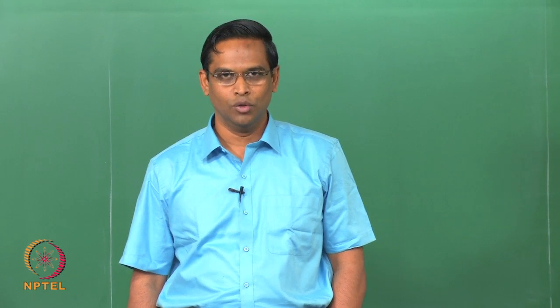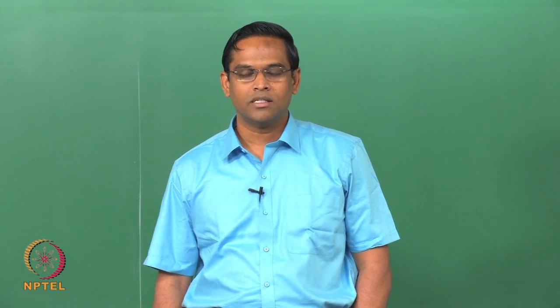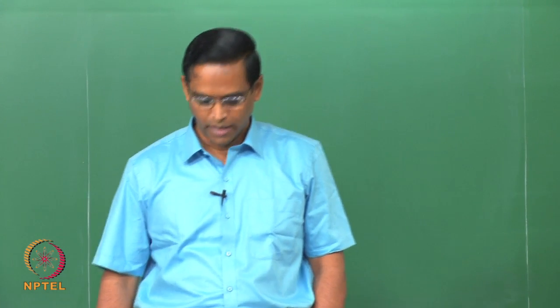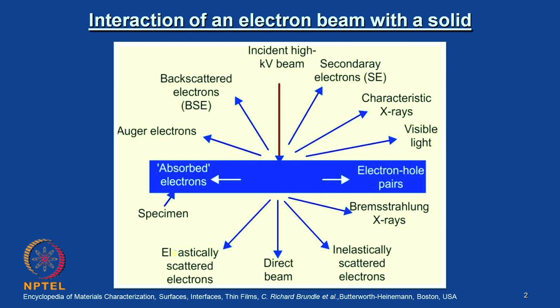So, before I start these lectures on fundamentals of scanning electron microscopy, I would like you to carefully go through what is shown on this slide. Before we get into any of this electron optics based instrumentation, which is used for imaging of materials to reveal the microstructure details, first we should know about the interaction of an electron beam with a solid. It is very general information which one should remember. I will tell you the importance of this the moment I finish this discussion here.